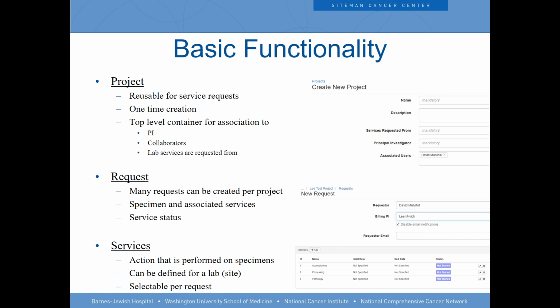One thing that I want to see from the cancer center's point of view is integrating the services with OpenSpecimen billing functionality at some point. And I think we've talked about that a couple times, but if we could do that, I think that would round out things very nicely.